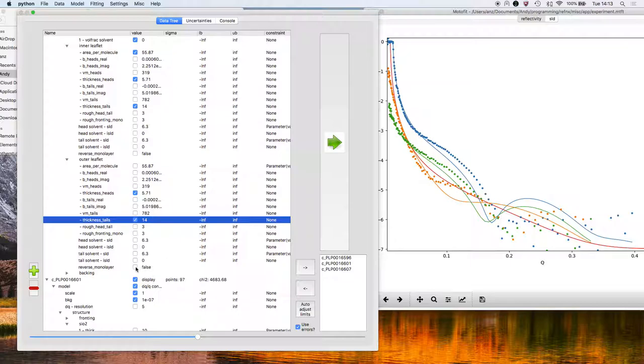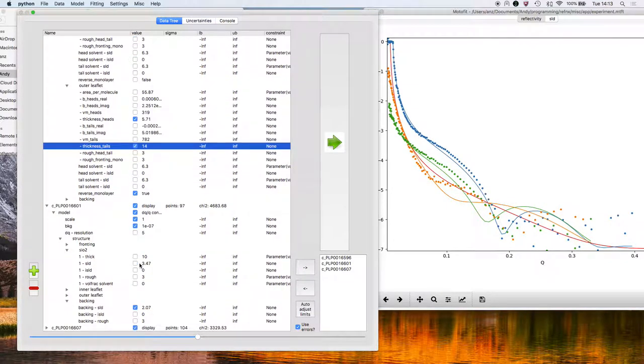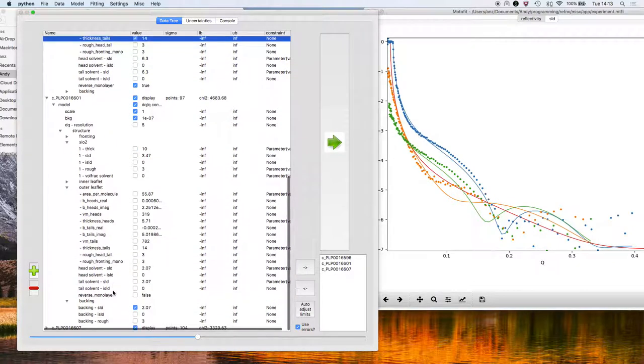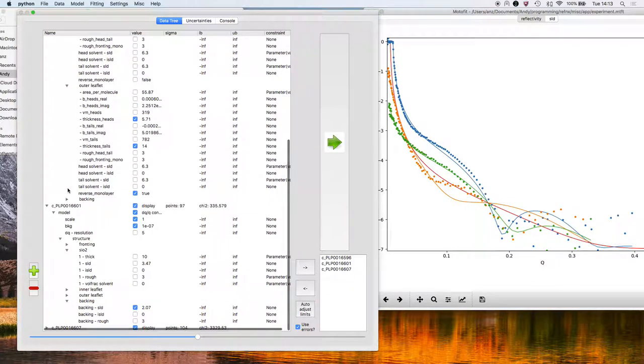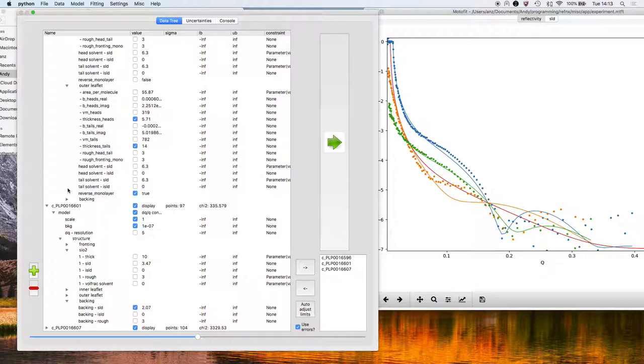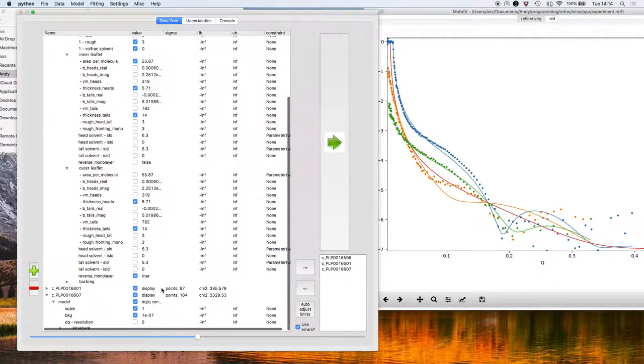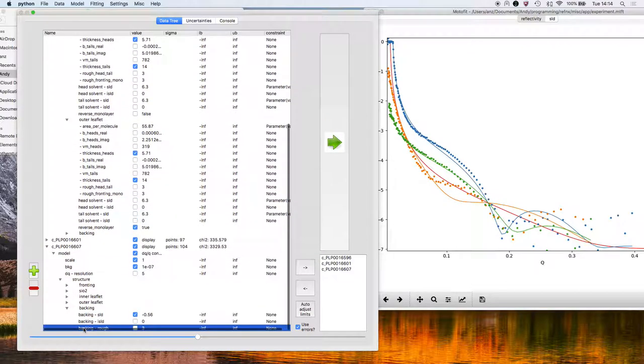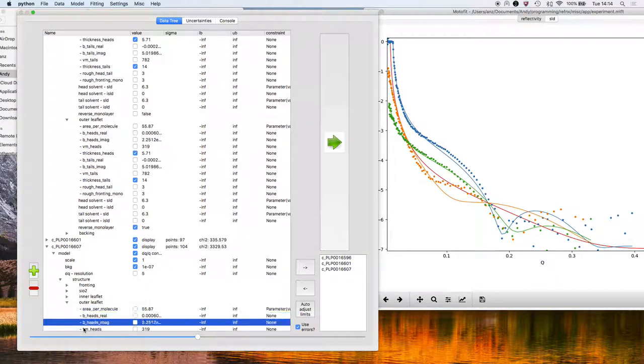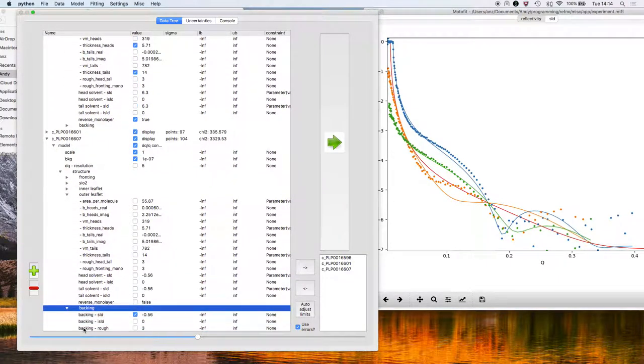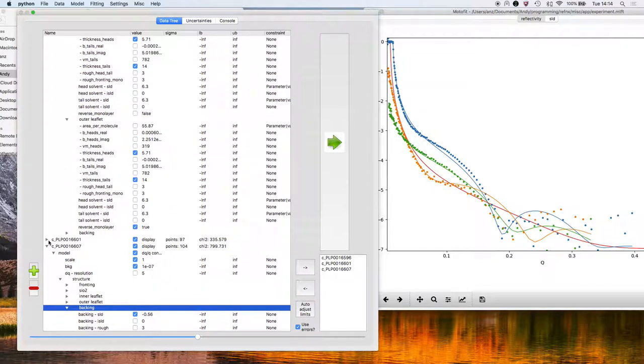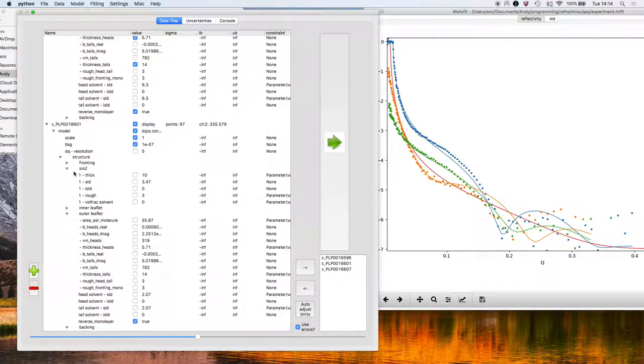Lastly, one thing that I didn't do during the original setup is to reverse the monolayer for the outer leaflet. By default, for each of these lipid leaflets, the head groups are towards the fronting medium. So for the outer leaflet, which is furthest away from the fronting medium, which is the silicon, we have to reverse that so the tails come first. And that's why there's this reverse monolayer selection. And we'll do that setup for the last, the outer leaflet in the last parameter, outer leaflet in the last contrast. Just check that it's been done for this one, yes.